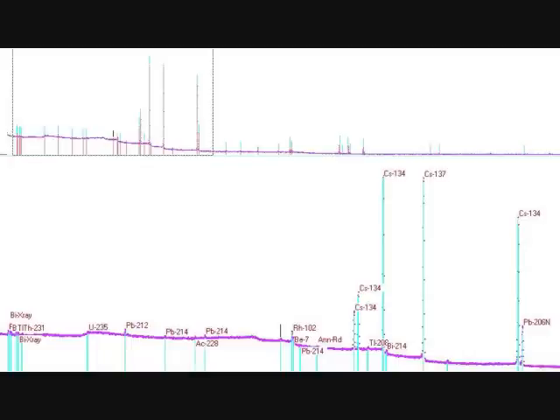This sample is from the Sagamihara area, just to the west of Tokyo, at about 250 kilometers away from the Fukushima nuclear power plant. The identified synthetic isotopes are cesium-137 and cesium-134. As for the exact activity, it's currently hard to determine, as we do not have the proper geometry calibration. But it is safe to assume that this soil from the gutter of Tokyo streets contains radio cesium in the kilobecquerels, or multiple kilobecquerels per kilogram range. As I said, it can be 50% off, but a 50 gram sample as to our analysis contains over one kilobecquerel of radio cesium already.